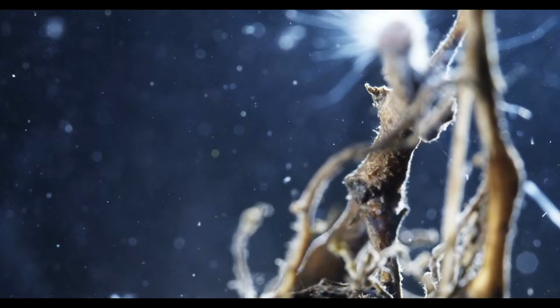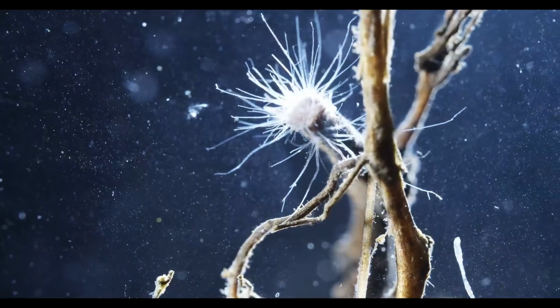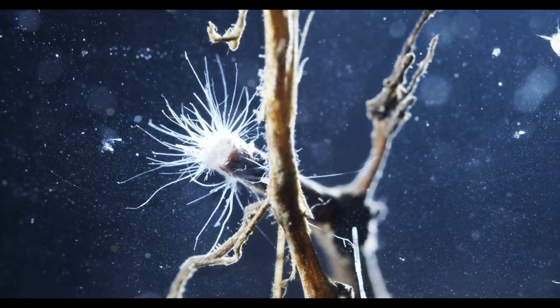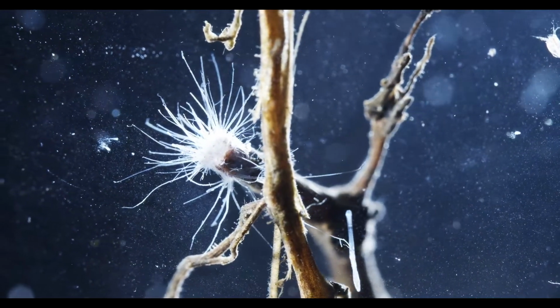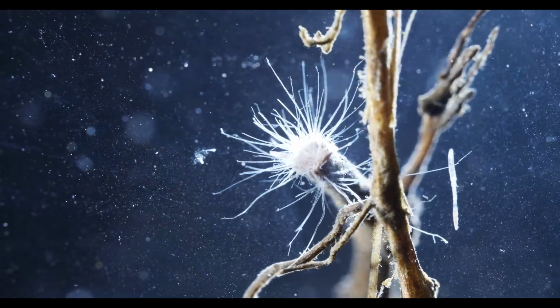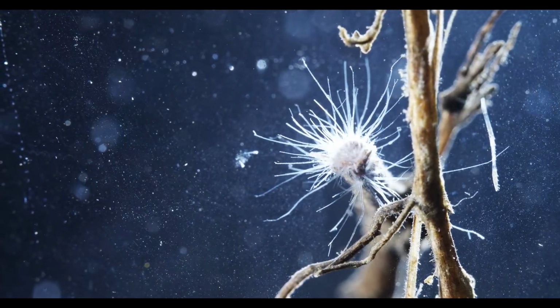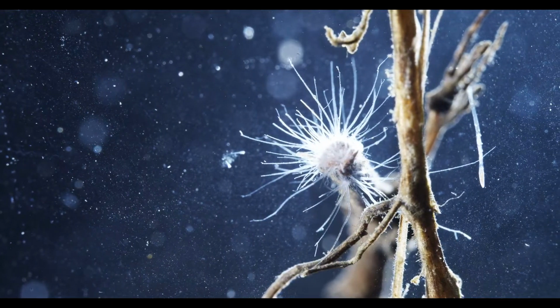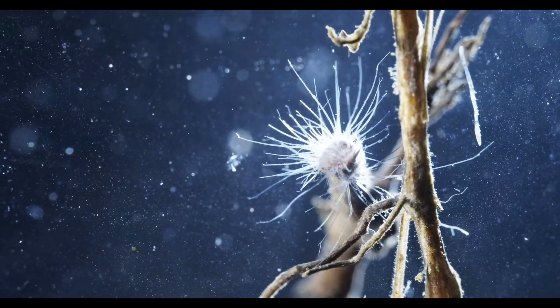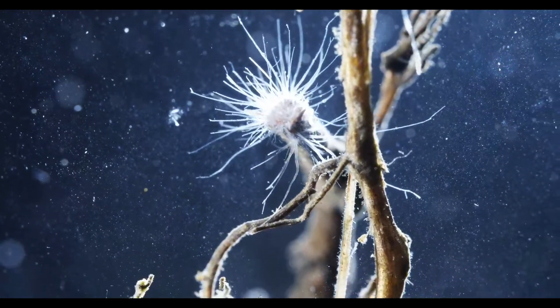And yeah, there's this thing again. Still kind of overexposed right now. Is that water mold? What do you guys think? Don't see any movement. No, I don't know.